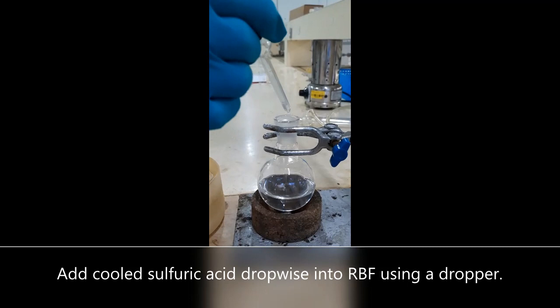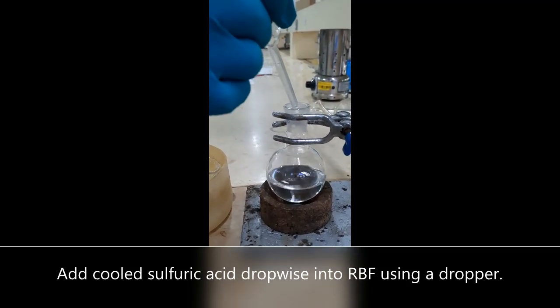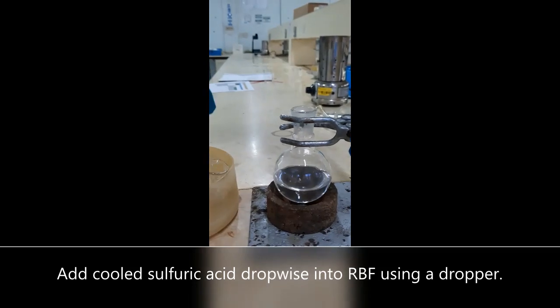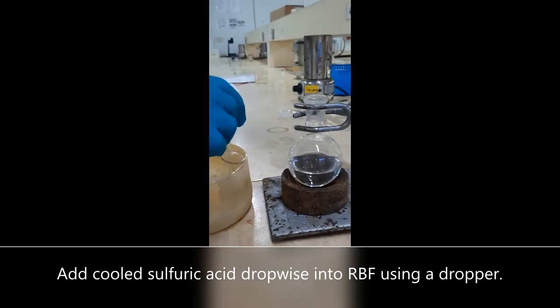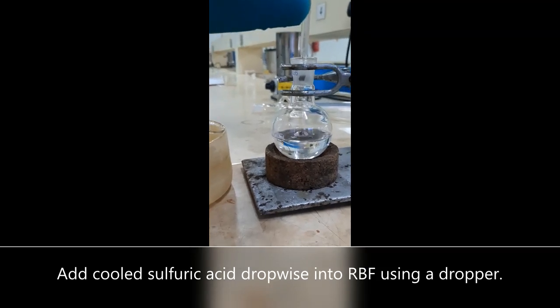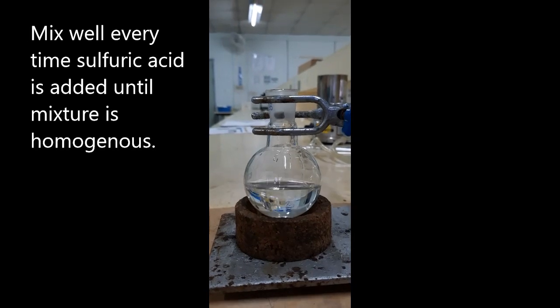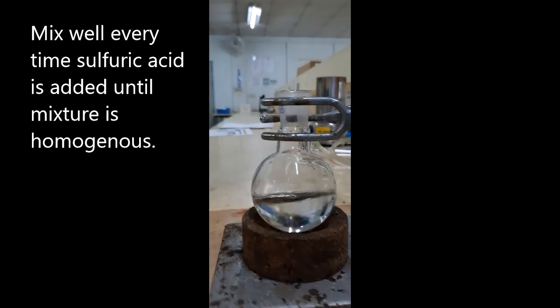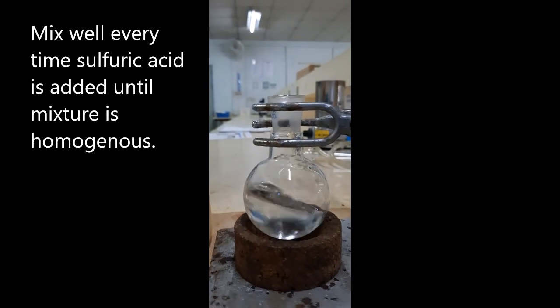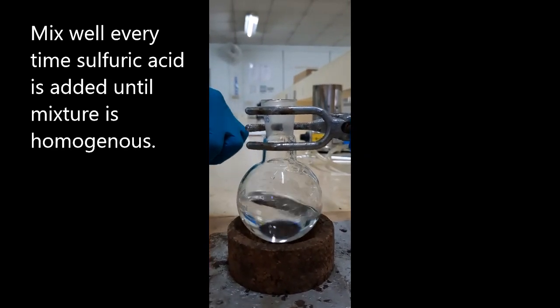Using a pasture pipette, add cool sulfuric acid in small portions into a round bottom flask containing ethanol and acetic acid. Continuously swirl the round bottom flask while adding the sulfuric acid to ensure a thorough mixing.